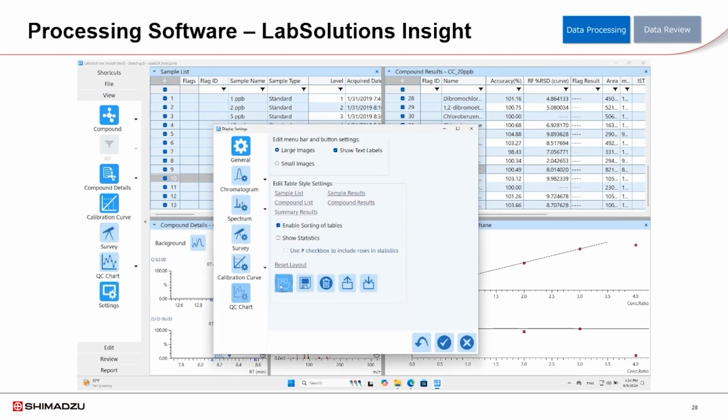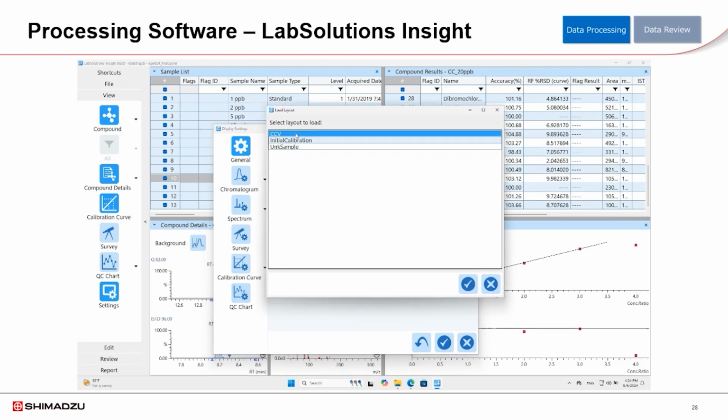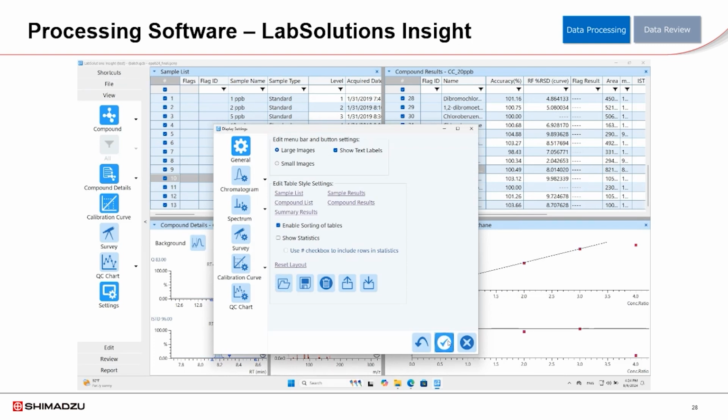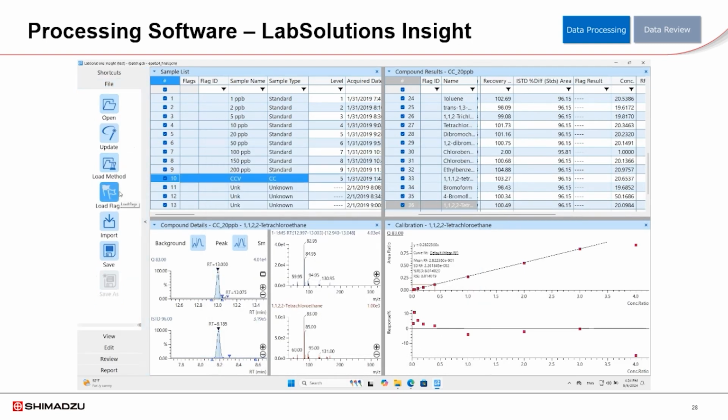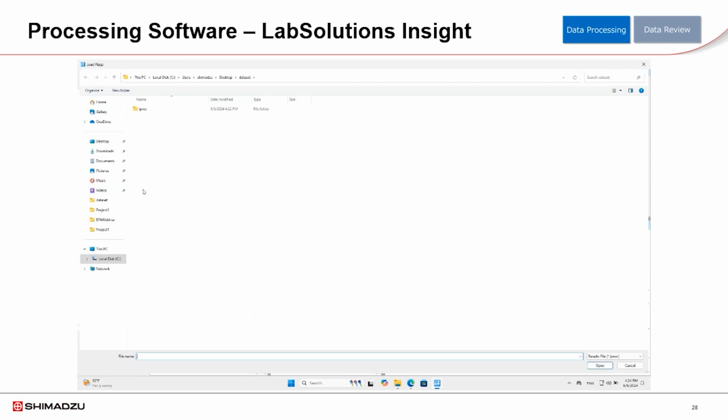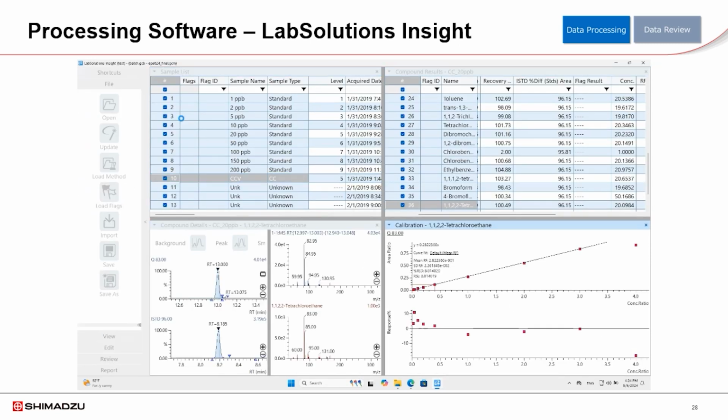So in here, we already put in all the targets within 20% accuracy. And also the ISTD should be within a certain range, and also the surrogate recovery. Once it's applied and everything is passing, it means that we can finally inject a real-world sample.